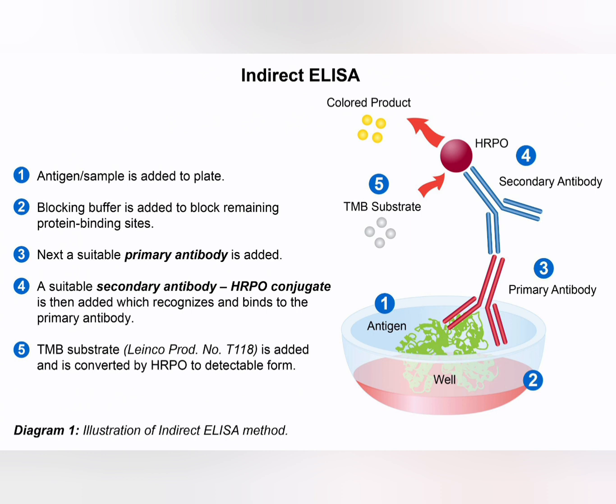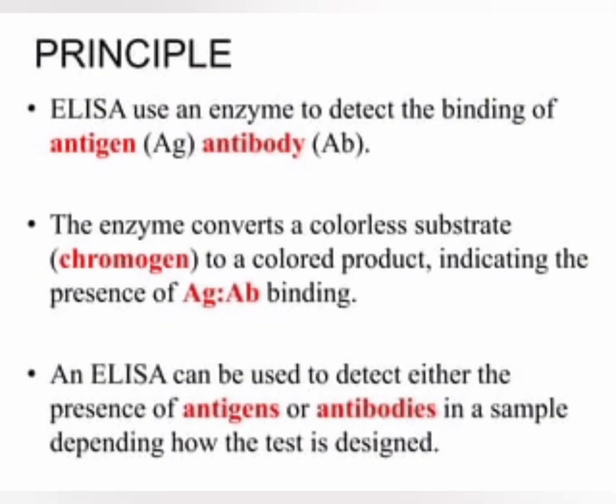well and incubated to allow interactions between the antigen and antibody. Any unbound antibody is subsequently washed away and the antibody bound to antigen is detected through the addition of a second enzyme conjugated secondary antibody, which specifically binds antibody 1. Any unattached antibody 2 is then removed and a substrate for the conjugated enzyme is supplied to the well.